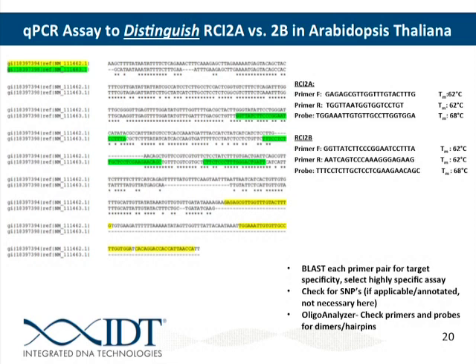So then we can... 0.8 or 8? Oh, it's 0.8. The zero is not showing up very well, or the point is not showing up very well.